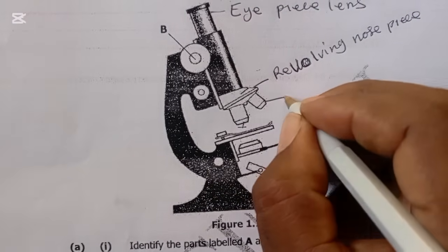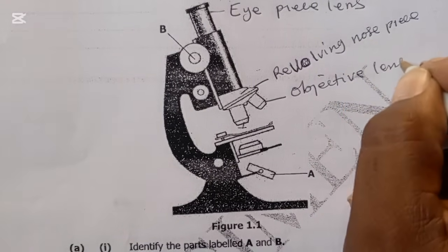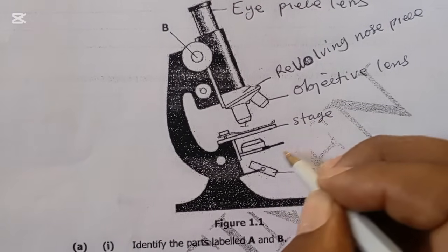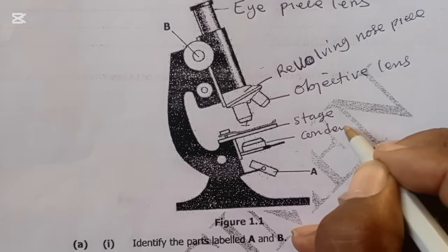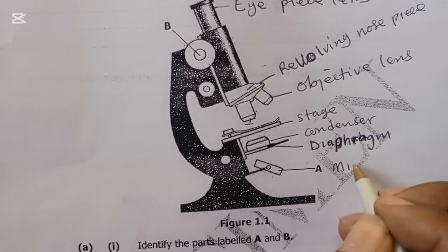And this is the objective lens. And this is the stage. And this is the condenser. And this is the diaphragm. And this is the mirror.